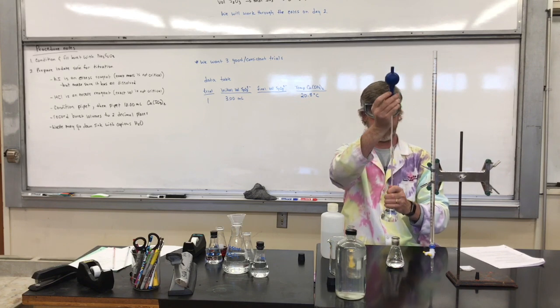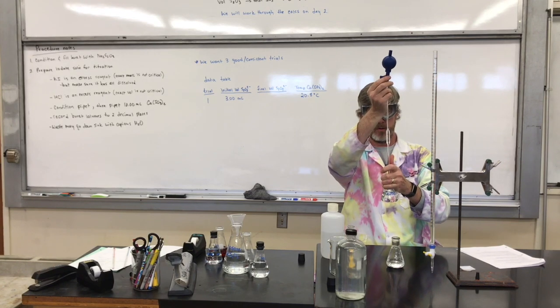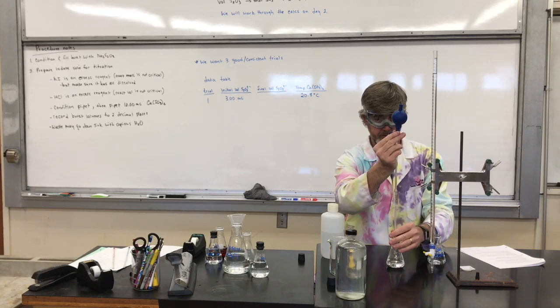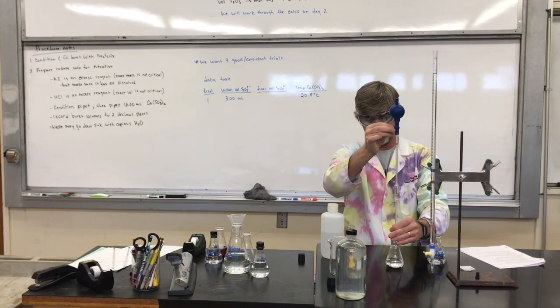Oops, a little too much. Got to draw a little bit back up. There we go. 10.00 mils, and we'll let this all drain into our flask.